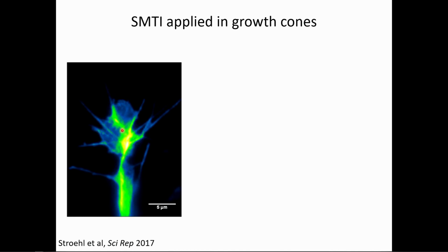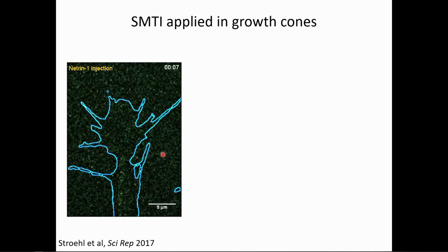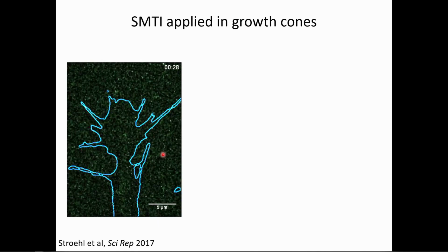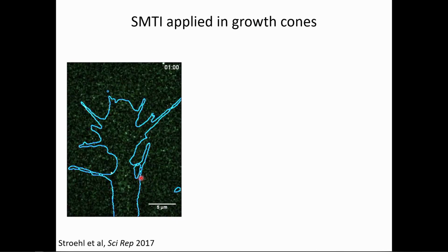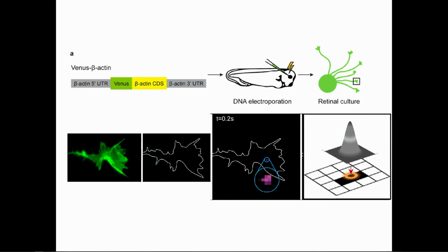So we can see, for example, that the protein we're looking at here, more of it is produced inside cells when certain chemicals emitted in the brain are present, so-called neuronal guidance cues. So we can mimic this by taking the neurons, putting them into a glass slide, and then putting these chemicals onto the outside of the cell. And what you see are little flashes of light. I'll play this again.